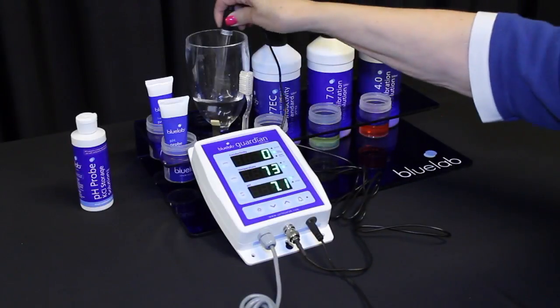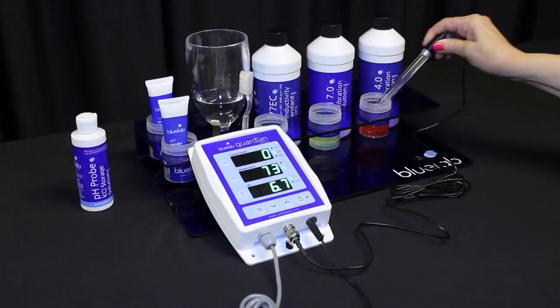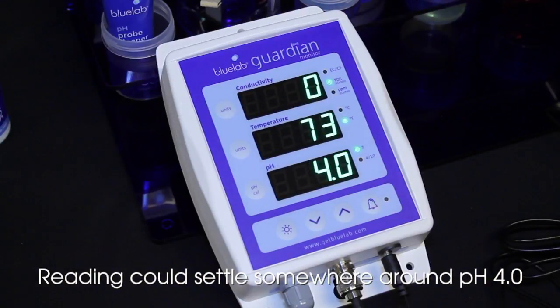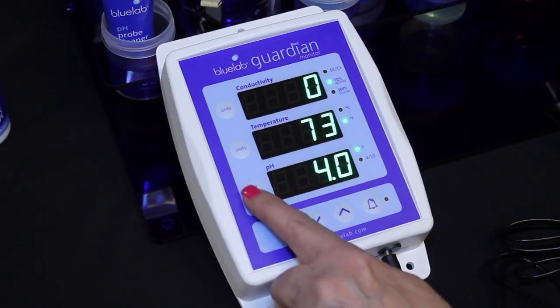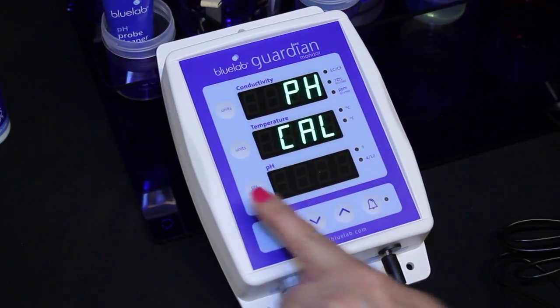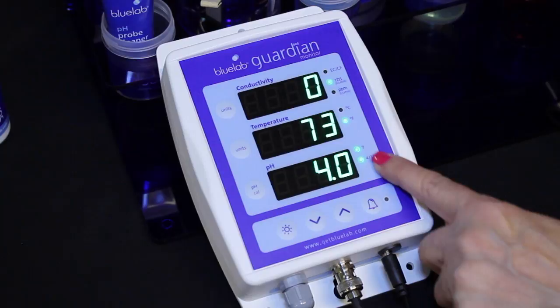Rinse the probe tip in clean tap water and place it in pH 4.0 solution. Be patient and wait for the reading to stop — it may take a few minutes. Press and hold the pH cal button until pH and cal appear, then release. 4 will flash on the pH display, then the pH 4.0 indicator light will glow.